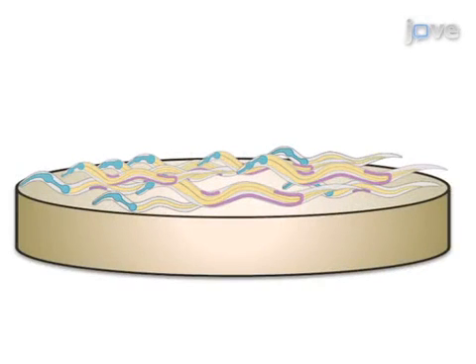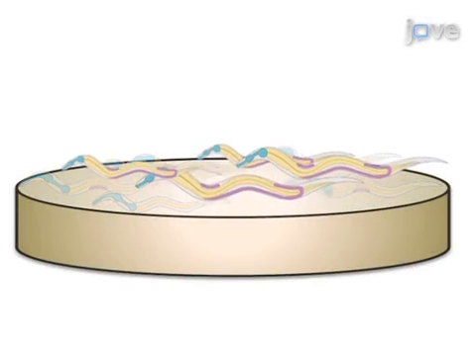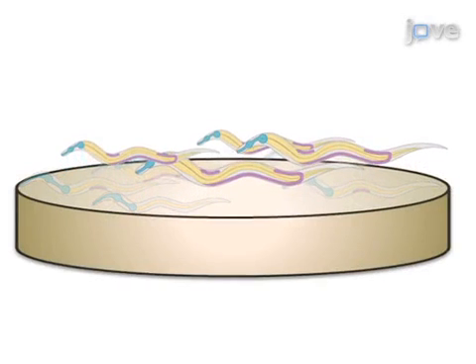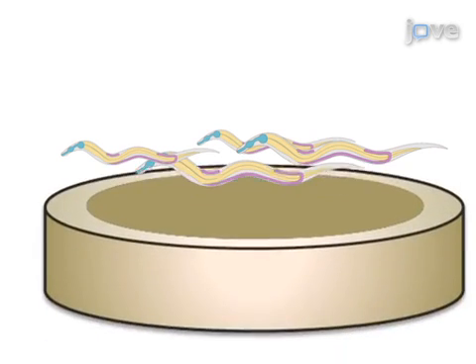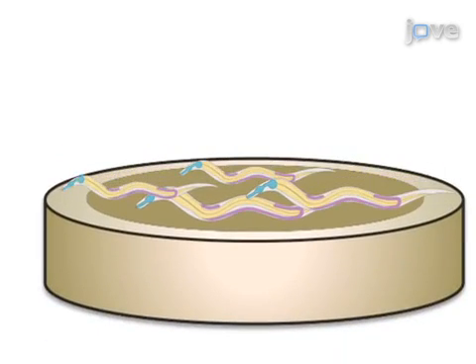This is achieved by first carefully selecting L4 stage larvae to ensure worms used in the assay are exposed to the desired environmental cue at the beginning of the adult reproductive stage. As a second step, L4 larvae are placed on lawns of different bacteria for a fixed period of time in order to expose worms to the cue during their peak egg production and laying period.